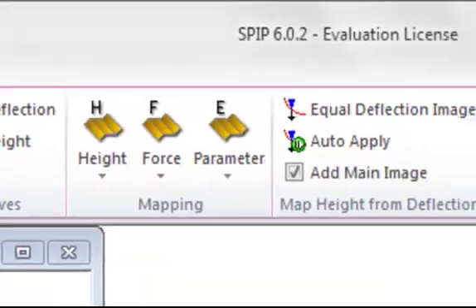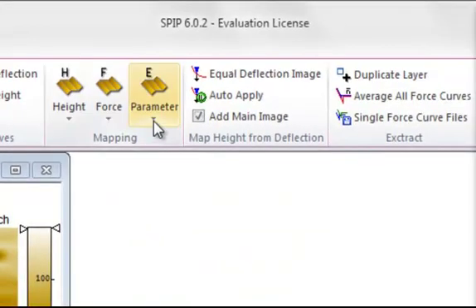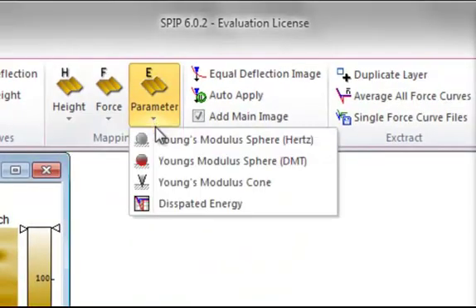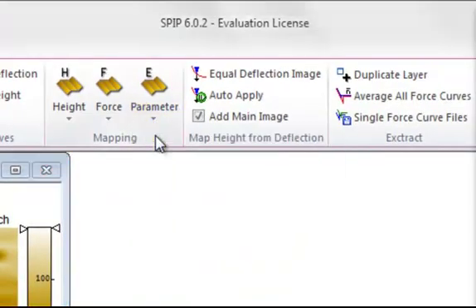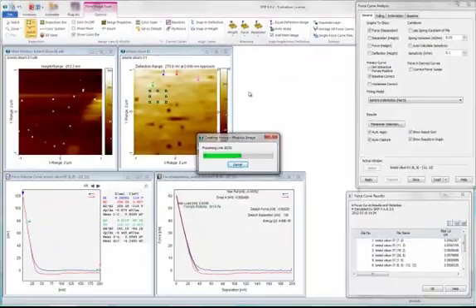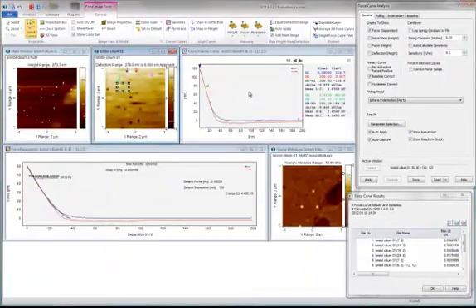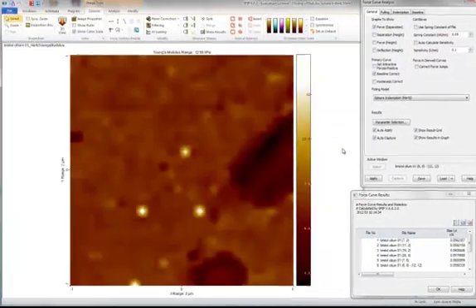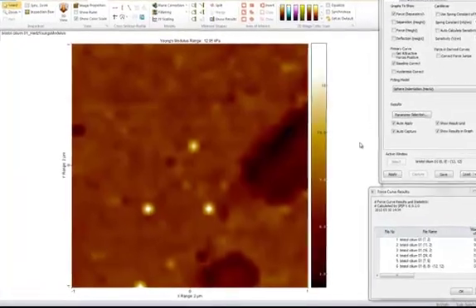Let's generate the Young's modulus map, which you'll find on the parameter menu. Now SPIP has generated the Young's modulus map.